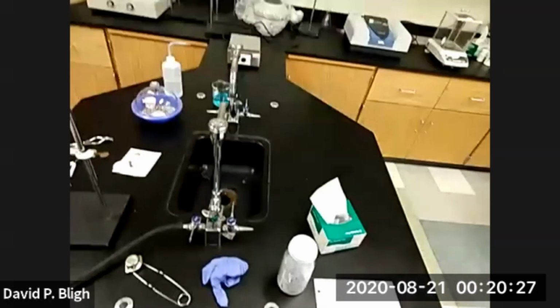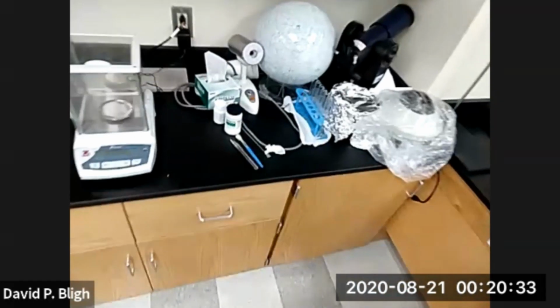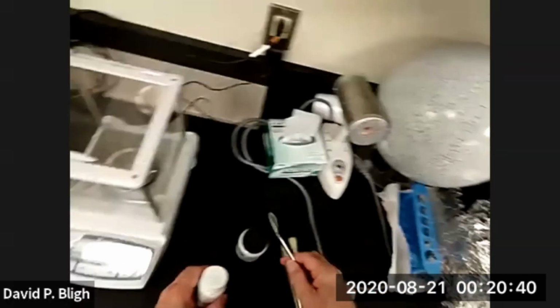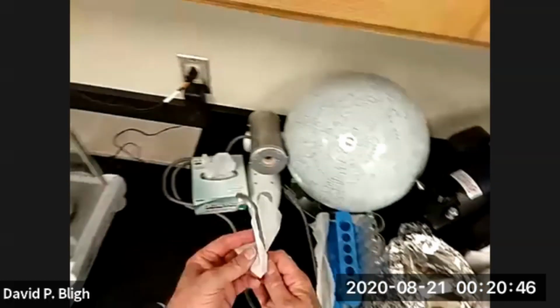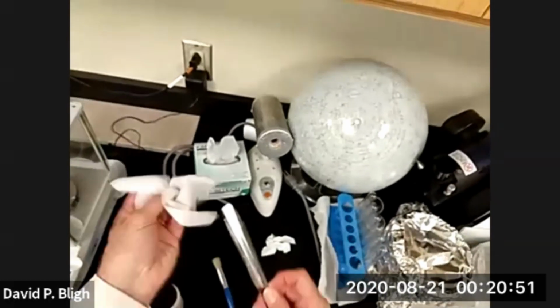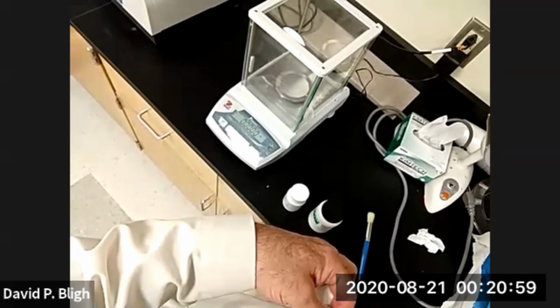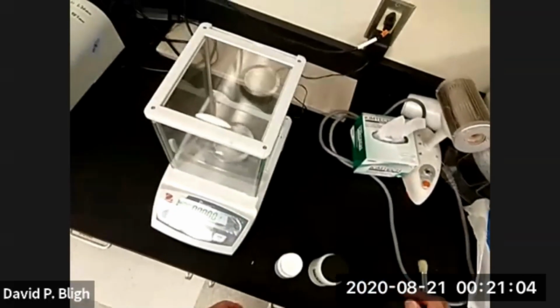Okay. Twiddle our thumbs time. Let's take our reagents here. Make sure they're sealed. Okay. We'll need the balance still, but we won't need these materials. Didn't use that, so it doesn't need to be wiped. I use this one. Okay. All righty.